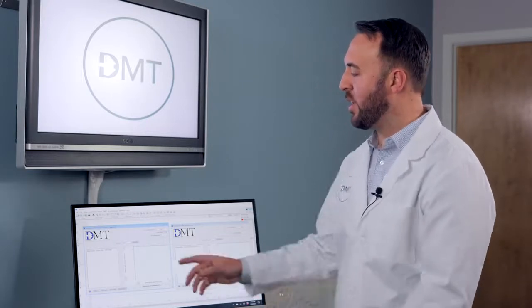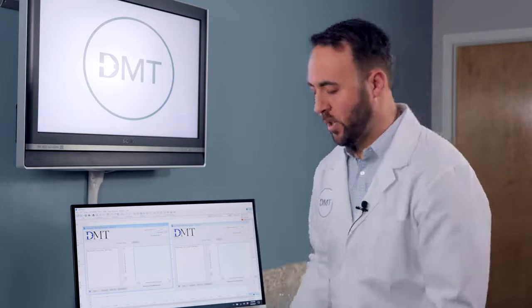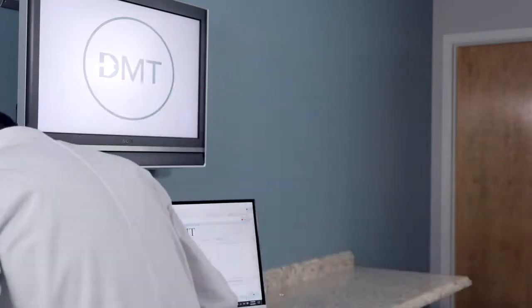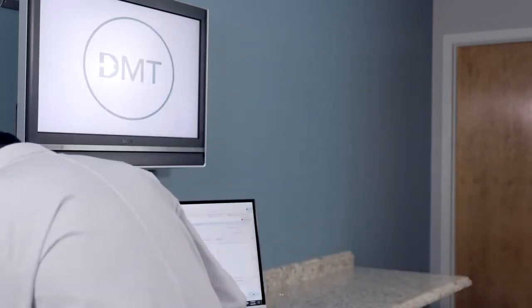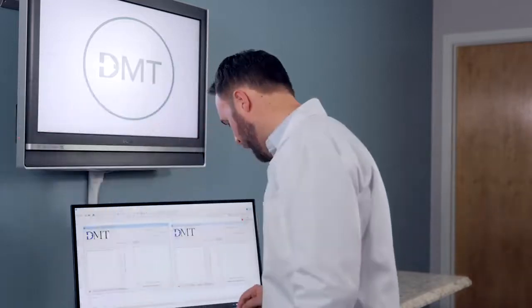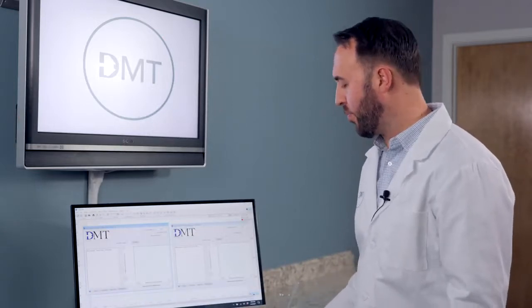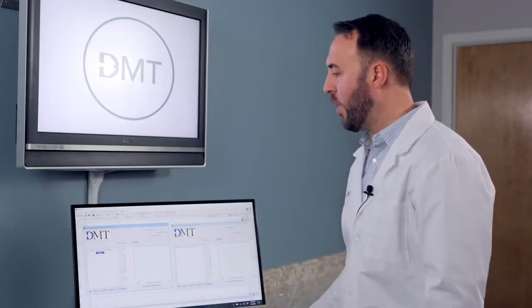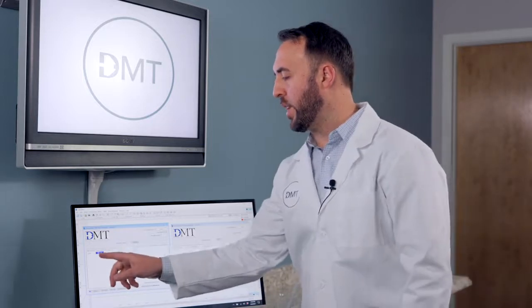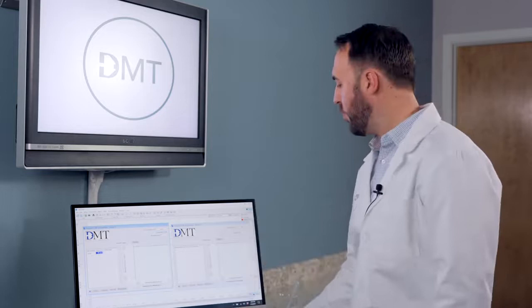And now we need to take a reading of the micrometer for channel 1. So we will take a reading. In this case, it is 2,230. And we will add that point. Now we have a 30-second delay on this one, so we can start with channel 2.